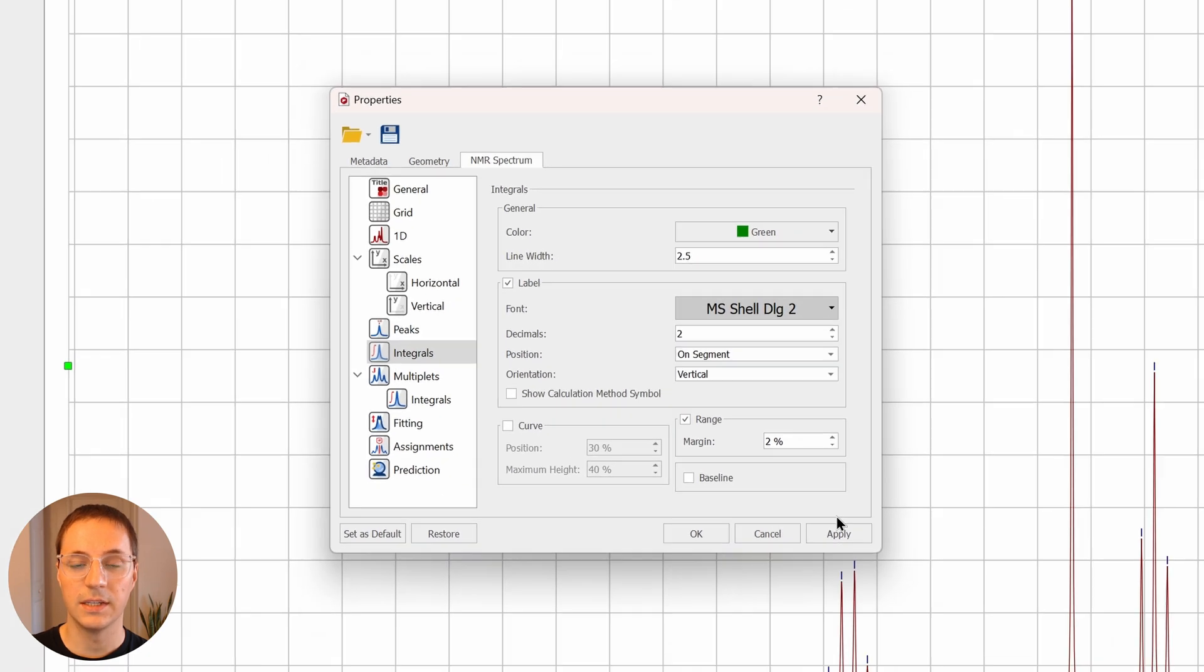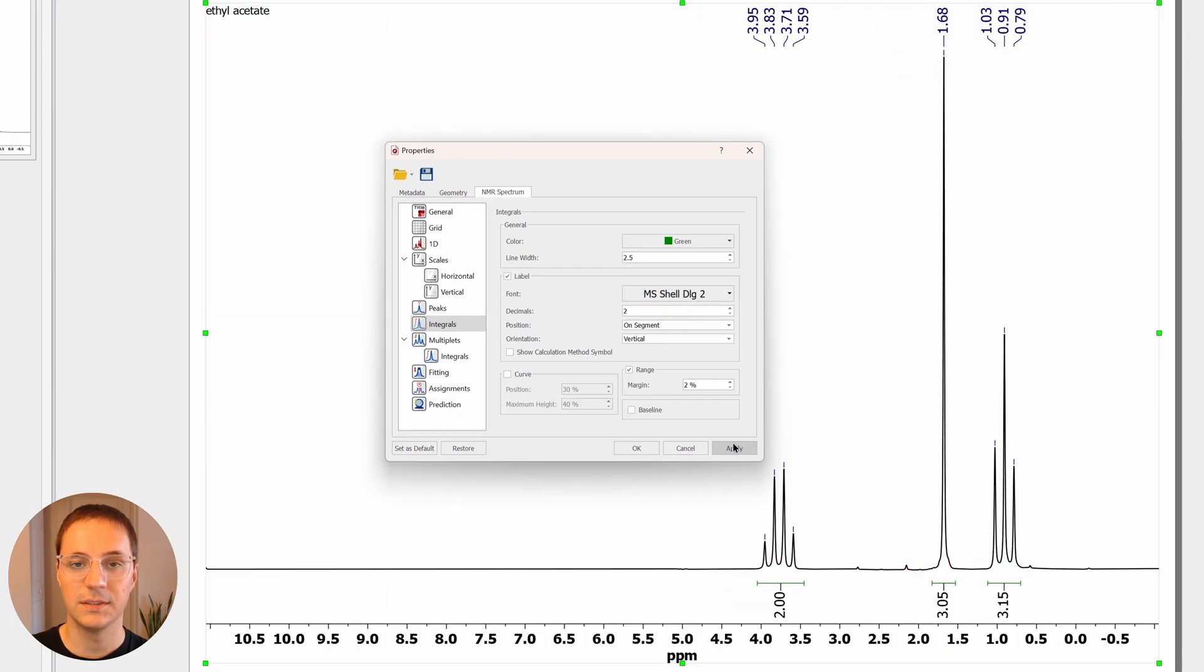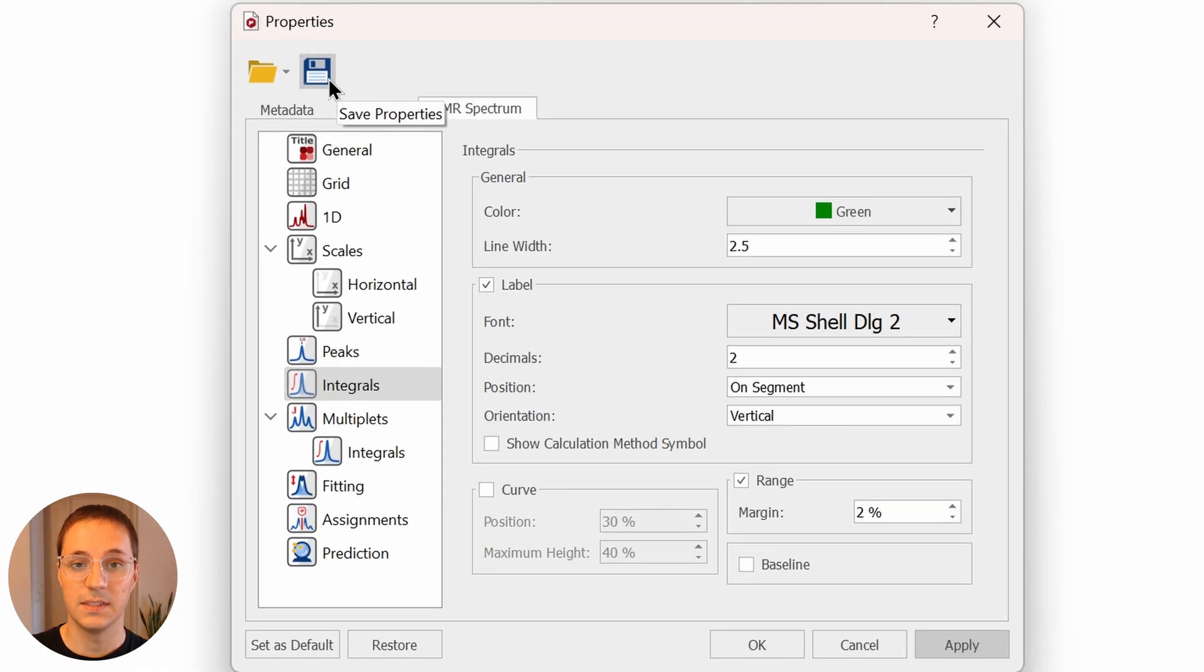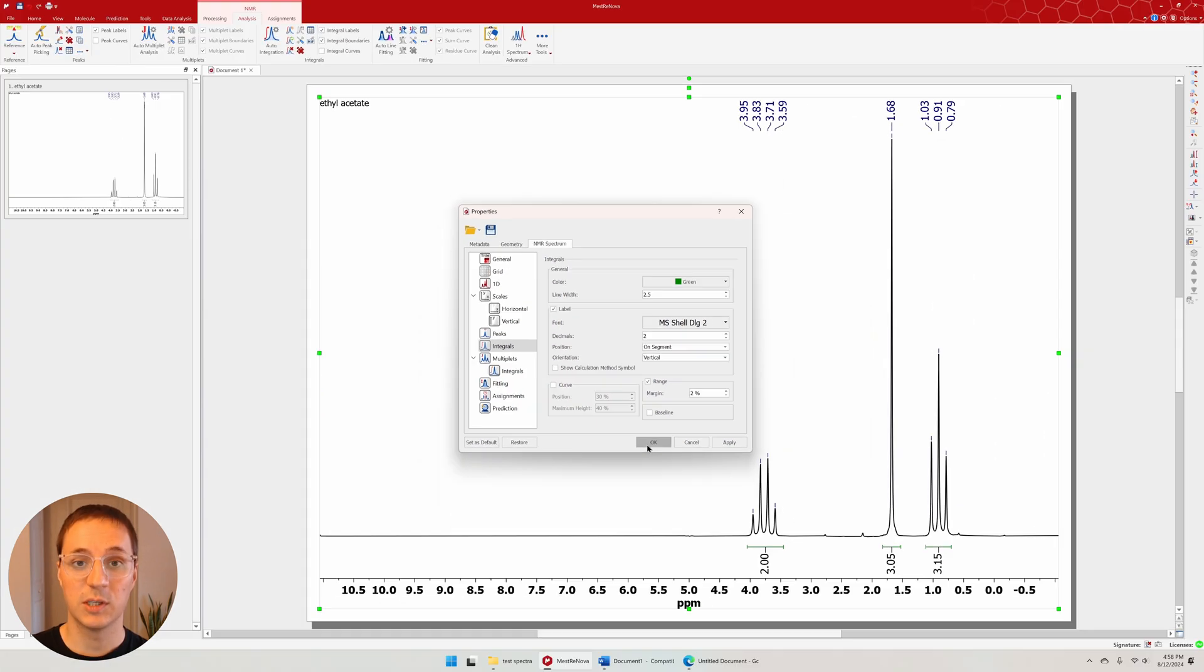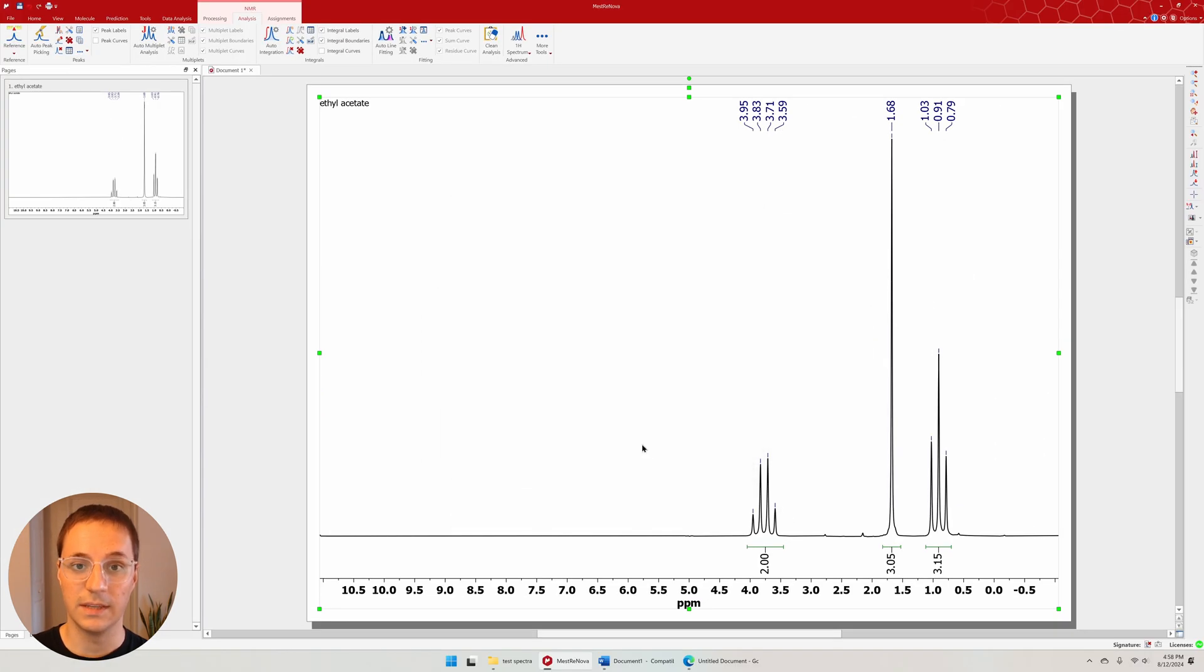Hitting apply shows our changes. I can save these properties or set them as the default. Now any spectrum I load in Mestronova will look like this.